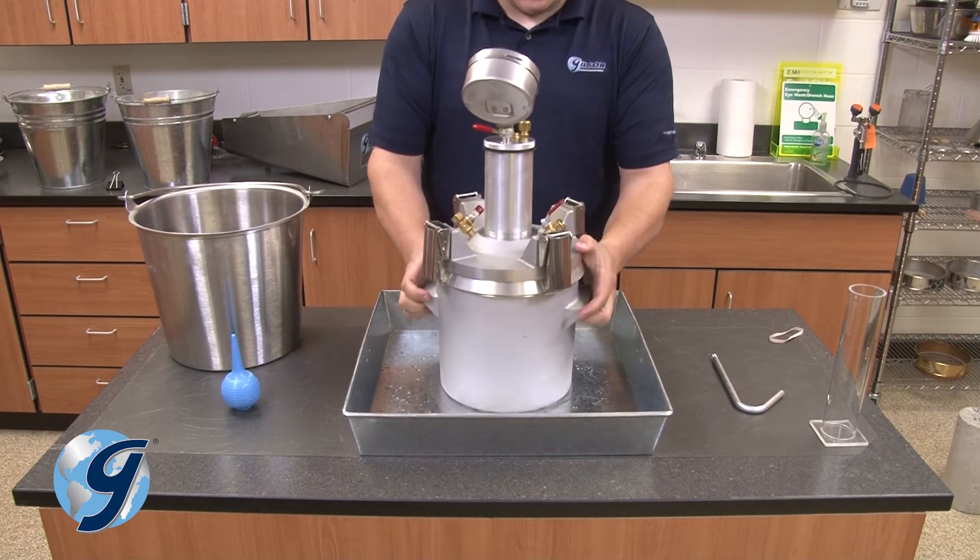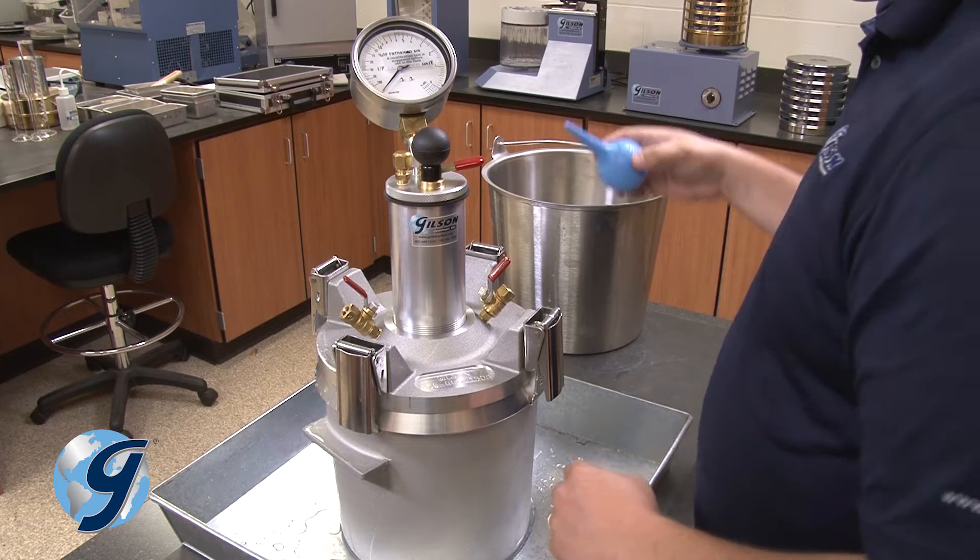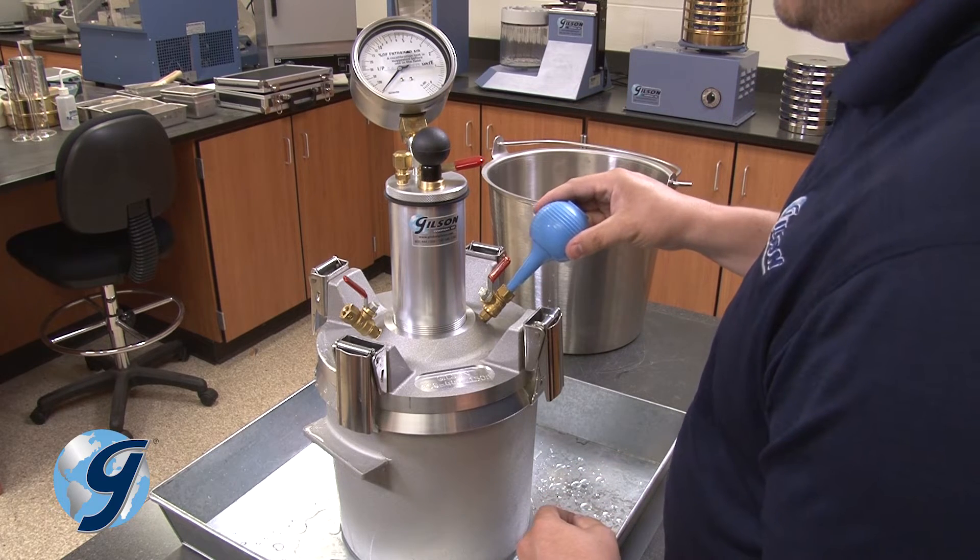Now, refill any water that's been lost by reopening the petcock and using the syringe to add more water into the same petcock as previously performed.